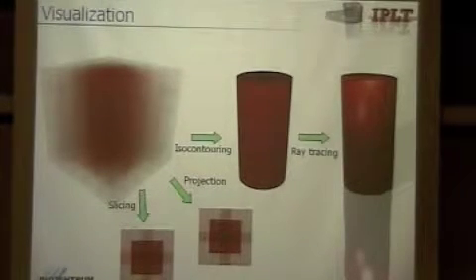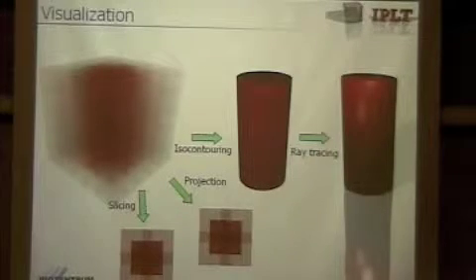Okay. Now, once you have this map, what do you do with it? There are different ways to visualize your map. The easiest two possibilities are to take slices out of it and have a look at the slices, or do projections. But in the end, you determined the 3D structure, so you also want to visualize it in 3D. So normally you go for isocontouring and then do ray tracing, and you get an even nicer image. This you can nicely put into your paper.